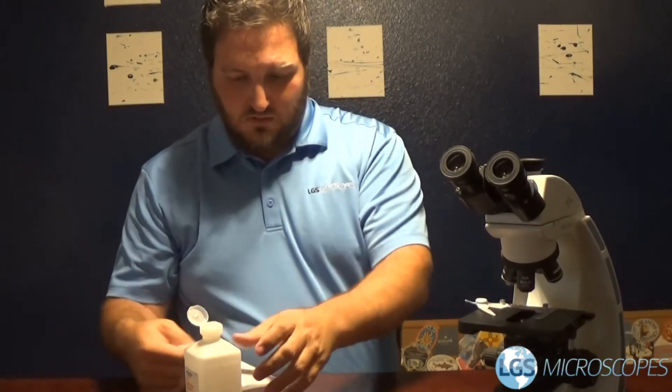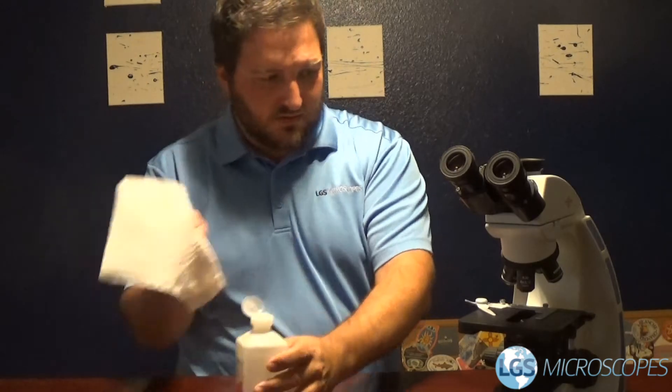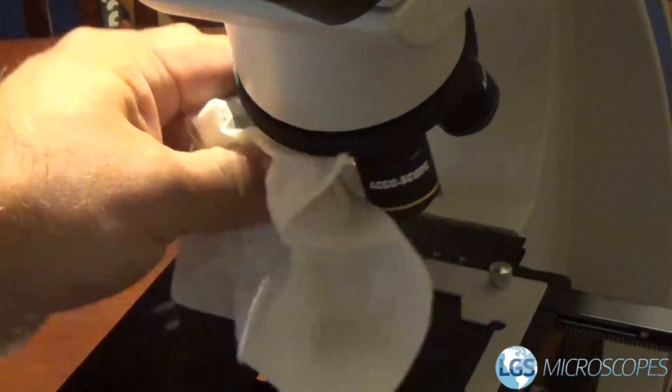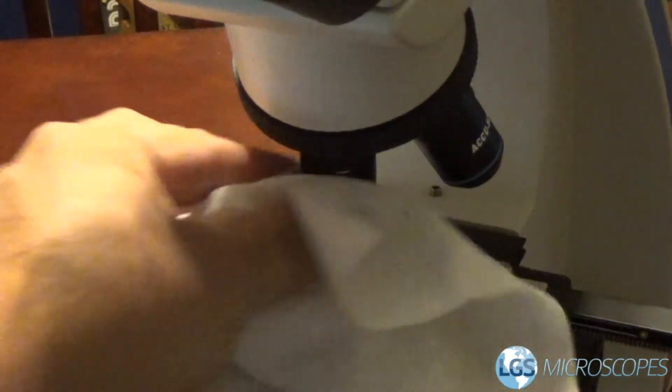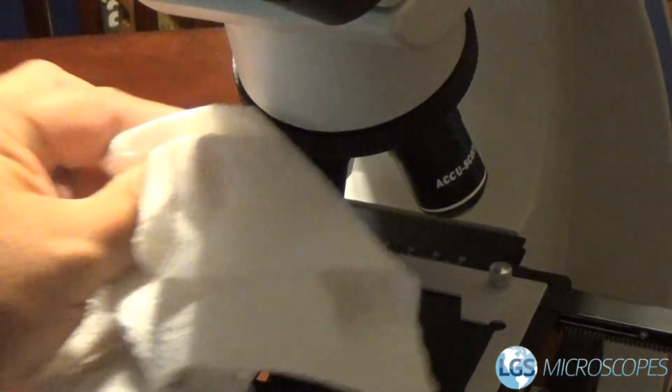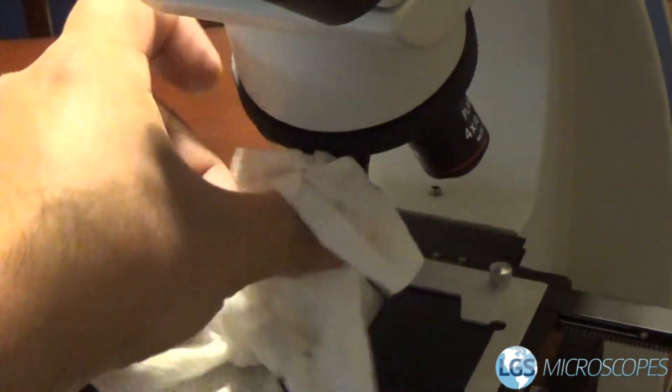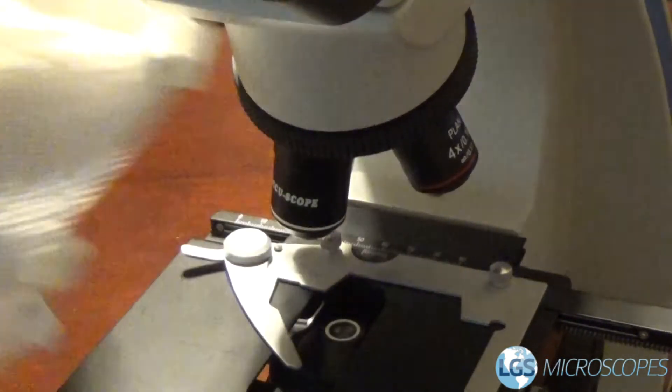And then last but not least, wipe off our objectives themselves. In some cases if you have a less expensive microscope, the objectives' paint will sometimes come off if it's a less expensive model. So if that happens, maybe try to find something else that's not going to take the paint off.